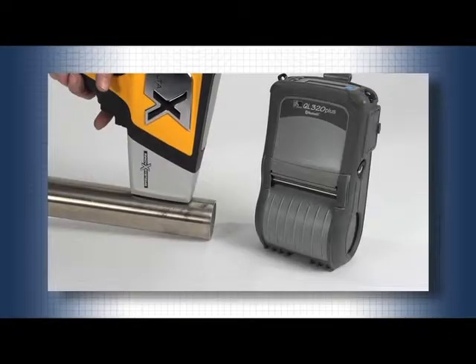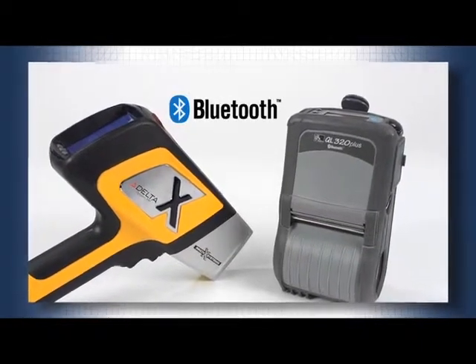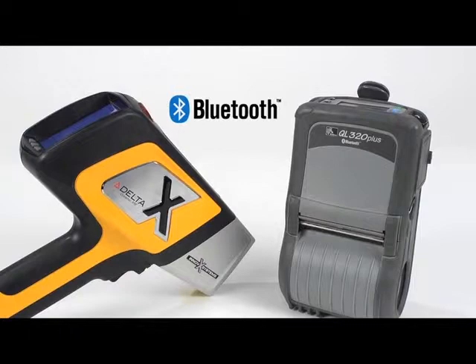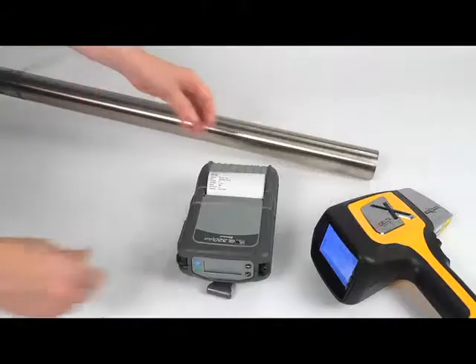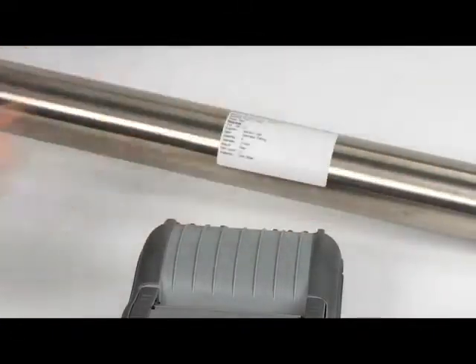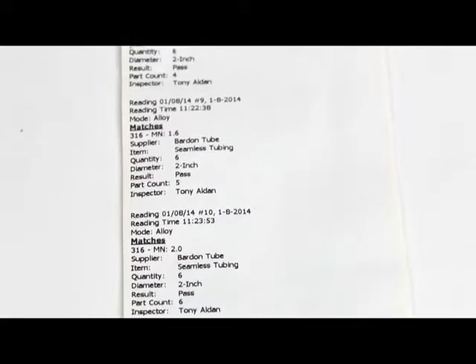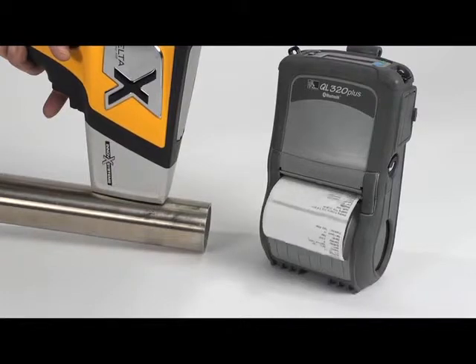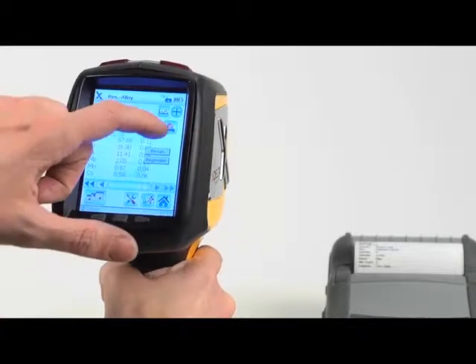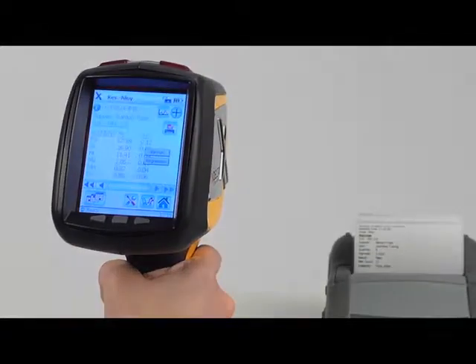In addition to creating a report from your test results, you can also print your test results. The Delta XRF analyzer connects wirelessly to a Bluetooth printer, which is sold as an accessory. You can print to a label, which can be used to immediately identify components tested, or you can print to receipt-style paper to include with other documentation. You can print the test results as soon as the test is taken, or you can choose specific tests to print after testing is complete.